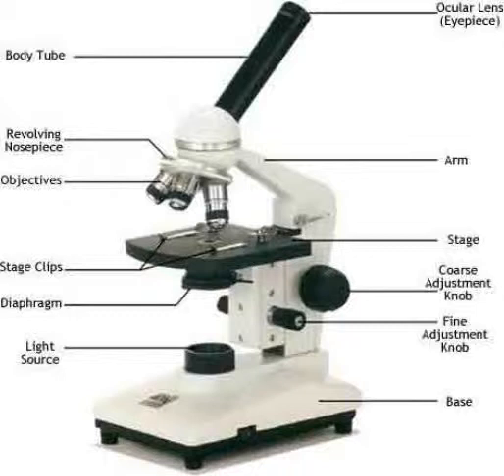The magnification of your microscope is equal to the product of the separate magnifications of the eyepiece and the objective. The magnification of each lens is written on the lens case. If the eyepiece is 10 times and the low power objective is 10 times, then the magnification under low power is 100 times. In equation form, this is written: eyepiece magnification times objective magnification equals total magnification.